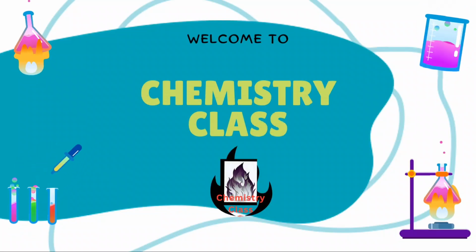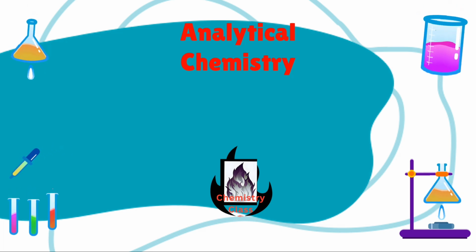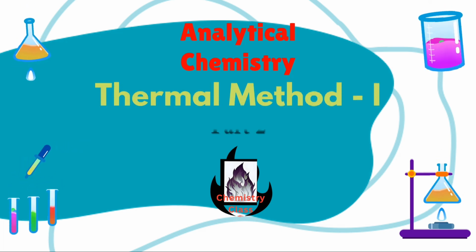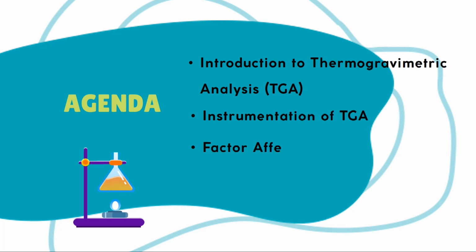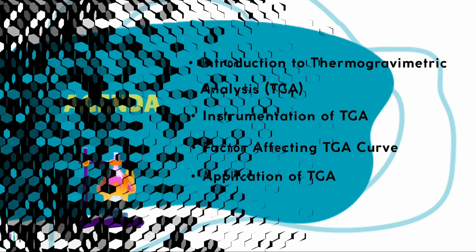In today's video, we'll continue our journey into thermal methods of analysis. We'll cover Introduction to Thermogravimetric Analysis, also known as TGA, instrumentation of TGA, factors affecting TGA curves, and application of TGA.